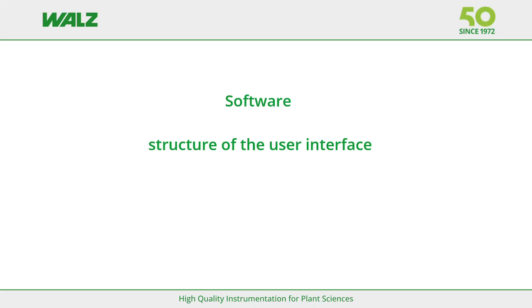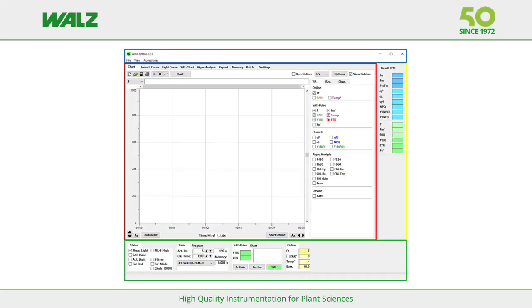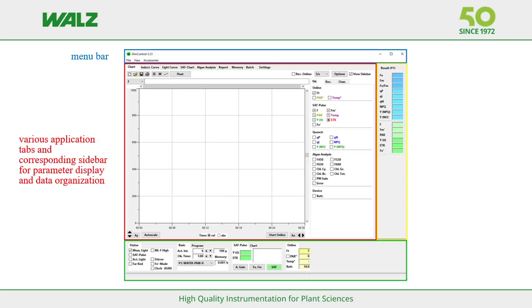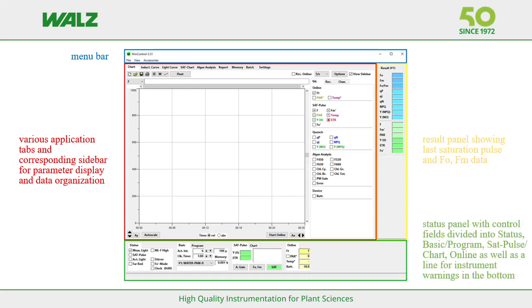Before I start explaining the various functions, I will introduce the overall structure of WinControl 3. The user interface is divided into four main parts. The first is the menu bar for data management and program display. The second part contains various tabs and their corresponding sidebars like chart, light curve, algae analysis, settings, or memory. The third part is the result panel showing data values of the last FO/FM and saturation pulse measurement — upon start it is empty. And last but very important, the status panel at the bottom where you can get quick access to many functions.